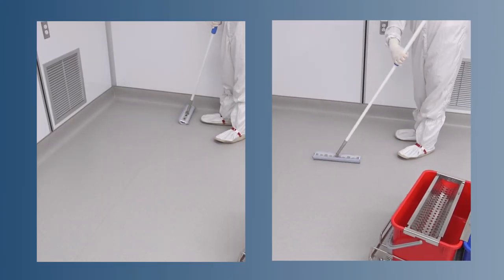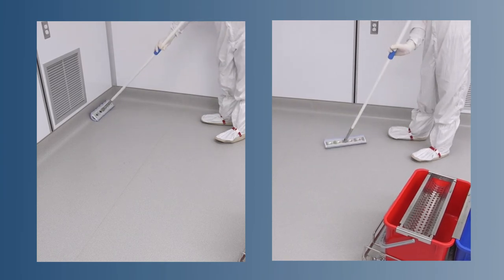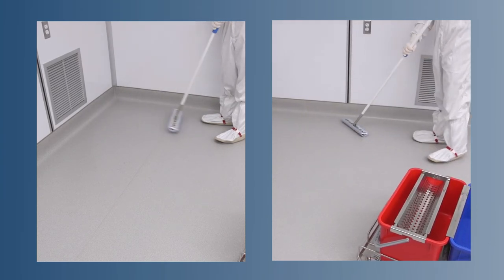Regardless of the method used, continue mopping out of the room until the entire floor surface is cleaned.